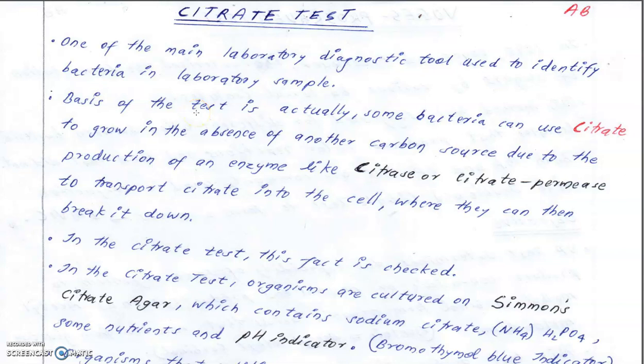Hi guys, we are back with another test, part of the IMViC series, that is the IMViC test. Now we can go to the citrate test.